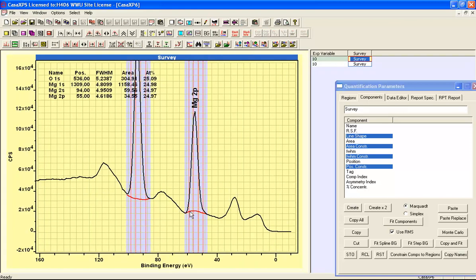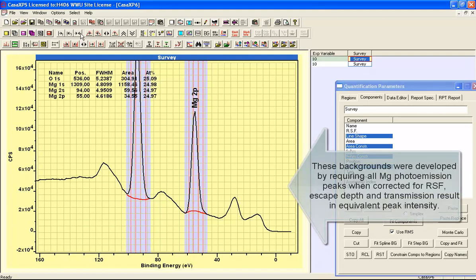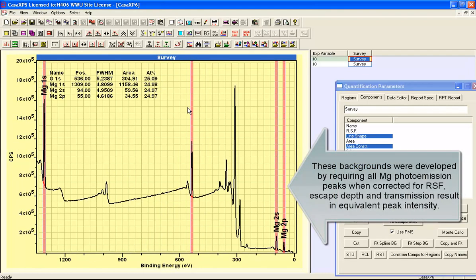And this is consistent with what we're seeing here. It may not be precisely the same, but you can see that the same nature of the background is required in order to produce a quantification that makes sense.